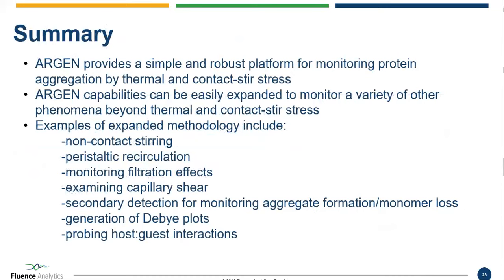In the studies we've done to date, I have not seen filtration promoting aggregate effects, though theoretically it certainly is possible through shear effects through the filter. We have collaborators who have seen filtration produce aggregation. We have very limited studies. Professor Wayne Reed is sitting in here with me. He's a director of Polymer MC, and he was saying that we do have some collaborators that have seen aggregation through filtration effects. We personally in our lab have not. We have looked at different filter materials, but we really haven't compiled enough data to see effects on that.